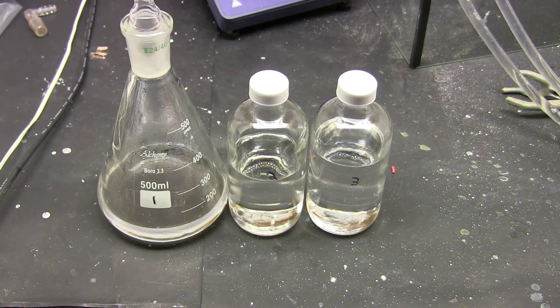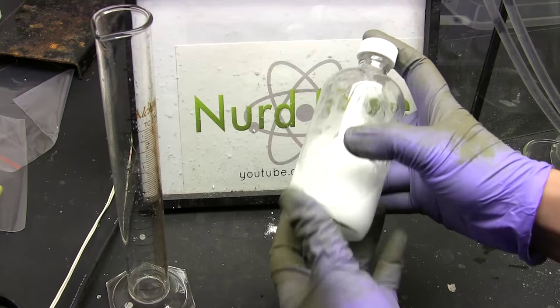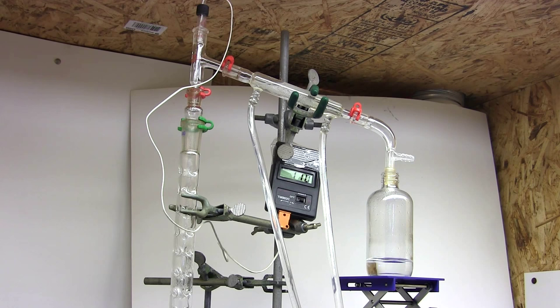But of course you guys don't pay me to cut corners. So let's see if there are any simple ways we can get some better separation of fraction two. Now there are a few ways we can approach this. One, we can mix it with water and try and extract it out, and to be honest this is probably the best way.